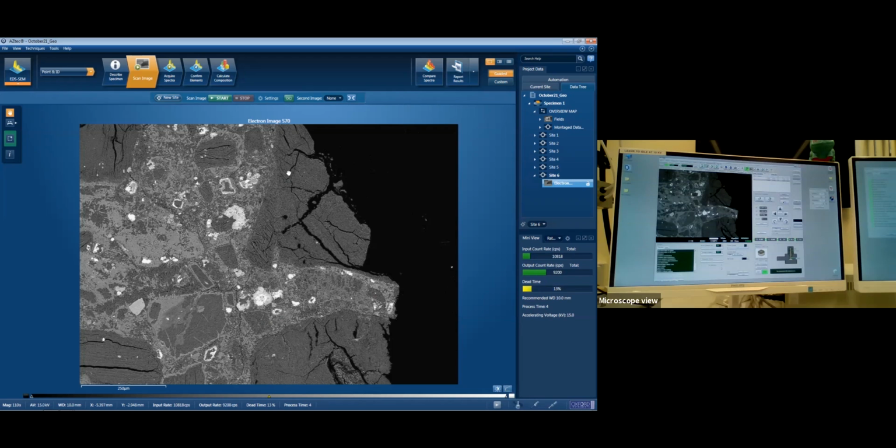So what we've got is these two darker grey things, if you think of the same crystal, or the same mineral at least. They might not be the same crystal, it doesn't look like they joined up properly. Yeah, some sort of mineral fragment and infill situation. It could well be dislocation, Nat, you are quite right.